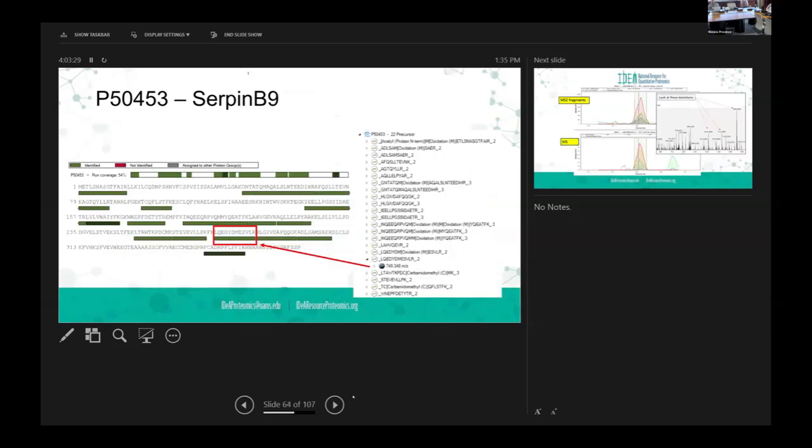Now, if we go in deeper in Spectronaut, and lots of the other tools will as well, it shows that there are actually 22 precursors that were measured for this particular protein. So, why are we having this conversation, right? Obviously it's there. There's plenty of things to quantitate on, and that one particular peptide is just one of many things that we could focus in on.